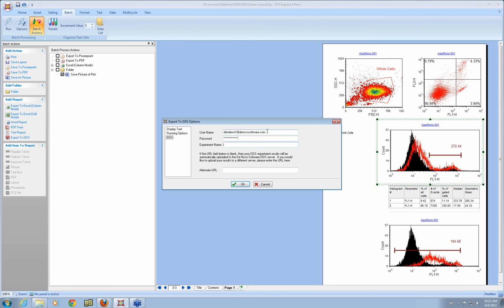And the experiment is called ApoMono. And the last field is called alternate URL. And I'm not going to put anything in the alternate URL. But this is for people who are hosting their results themselves.